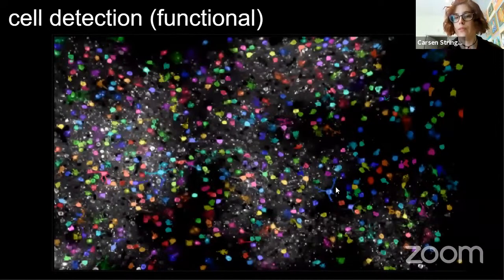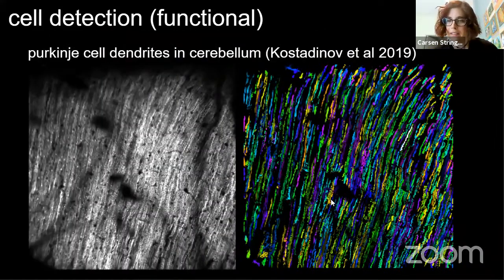Also, I think you can do post hoc processing and say, maybe I want to focus on these different things separately, but that depends on the user too. Later on, I'll show how you can cut off dendrites if you want to. There's a question from YouTube. In cell detection, do you have any annotations on the cell, like cell 1, cell 2, etc., later to find the same cell info for longitudinal images? Is cell detection manual, semi-manual, or fully automatic?